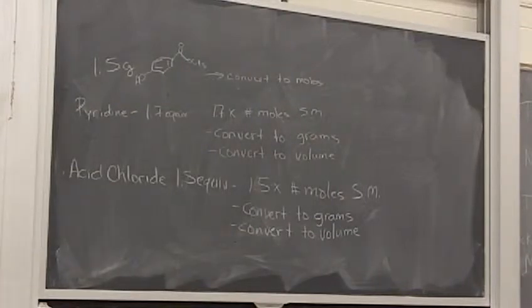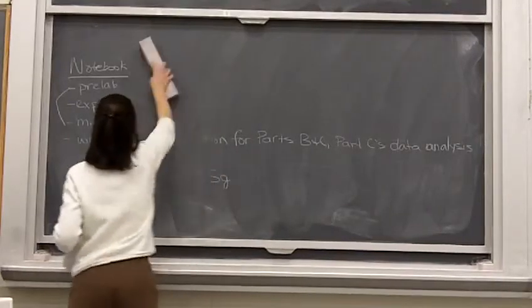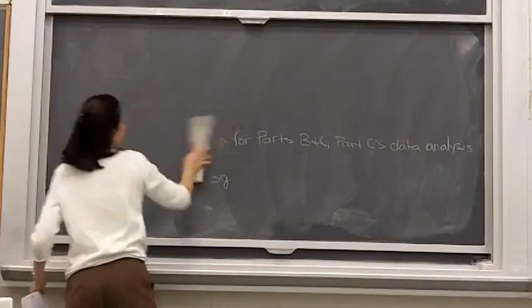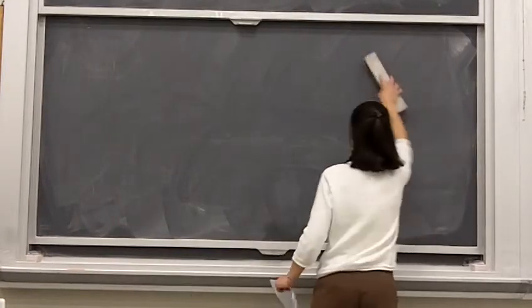Now, for cleanup, there are a couple of things we need to take into consideration, especially for the butyryl chloride. We've got to kill the stink, basically.